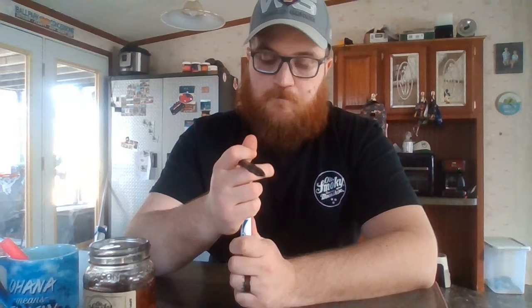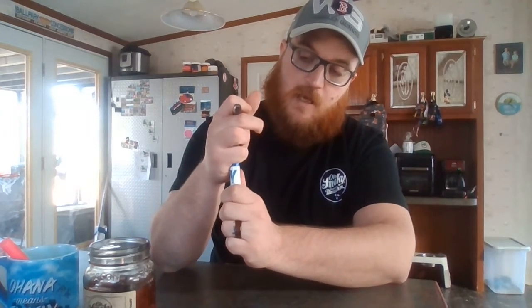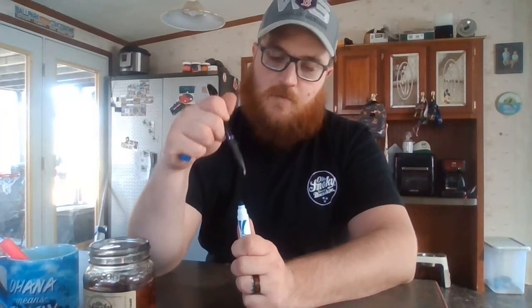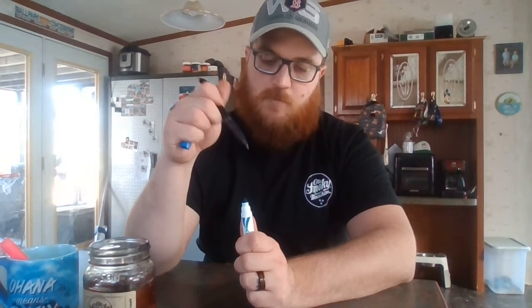And then I would start by taking the initial tube with the culture in it, with the initial culture. I would pull the lid with the pinky finger of the hand holding the loop. I would flame that about 3 to 5 seconds. Pull that, and then I would stick the sterilized inoculation loop into the sample to get into the culture to get my sample.